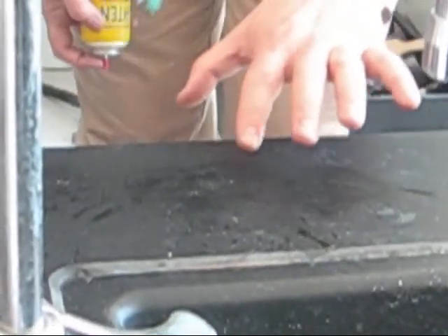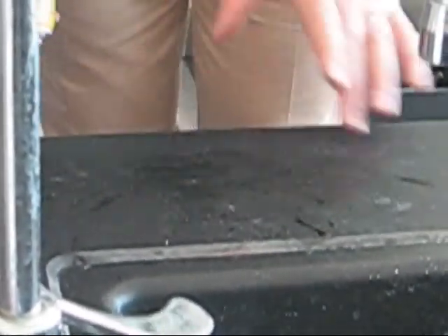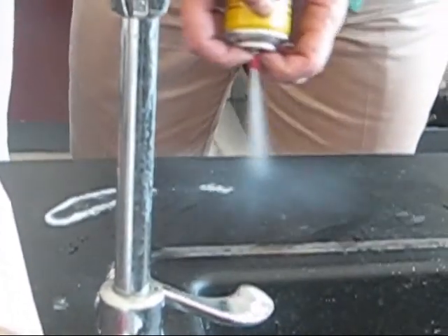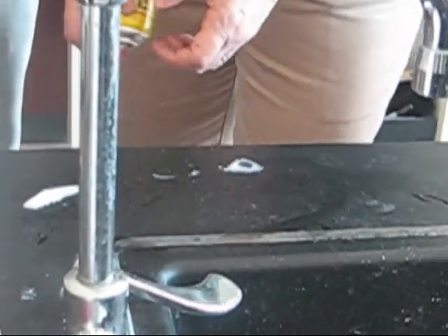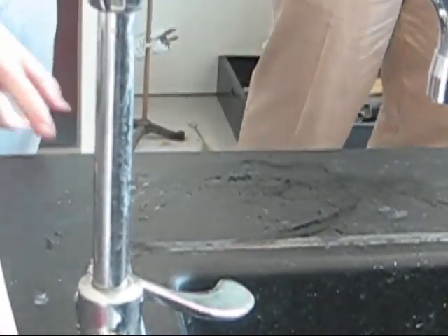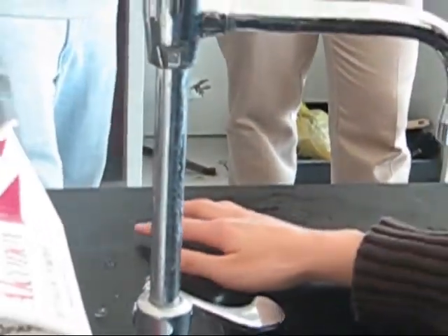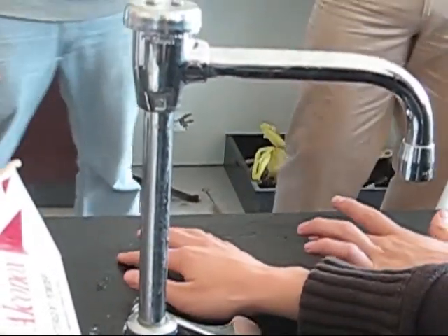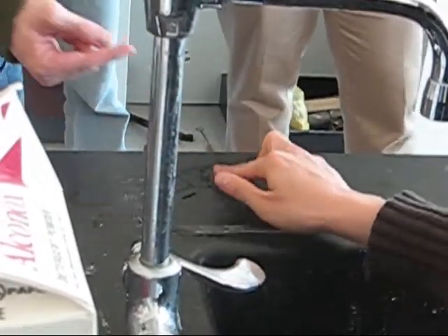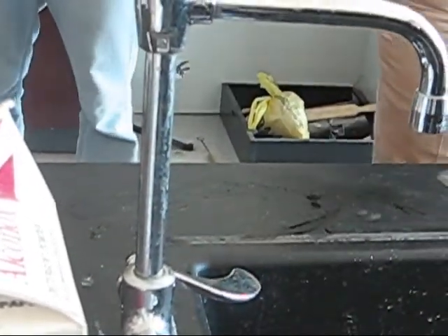There's ice. That's not ice. Yeah, well, if you feel it, yeah. You can actually make ice. You can see some frost being formed there. And it does indeed make ice. You can feel it. Feel that there. Somebody confirmed that. If I sprayed your skin with that, it'd freeze your skin. And you'd have a frostbite, and perhaps a very serious freeze burn, which would hurt.